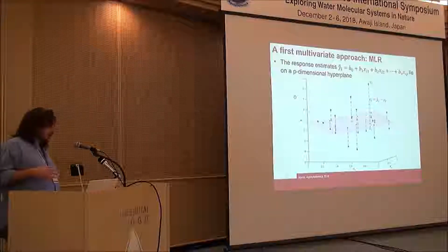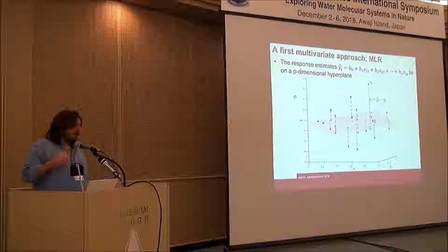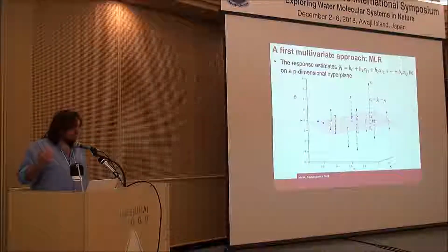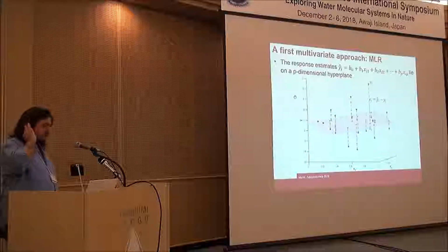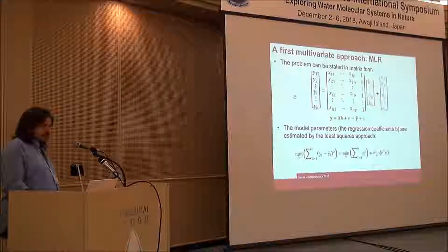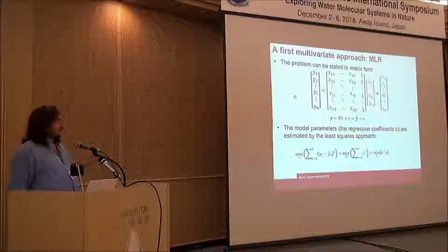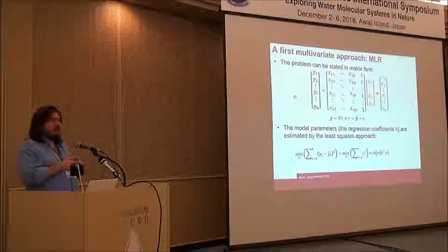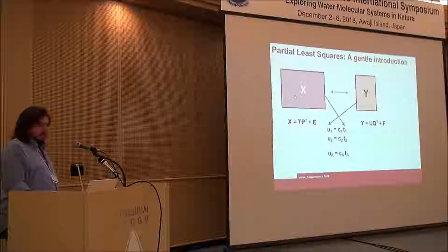Of course, taking into account that I will have a certain kind of error due to, first of all, measurement error, but also model error or possible interference that is present in the data. And this is just the matrix way of stating the problem that may be used to describe the main characteristics of the models that are normally used in this context.